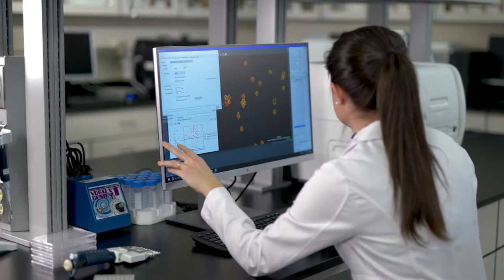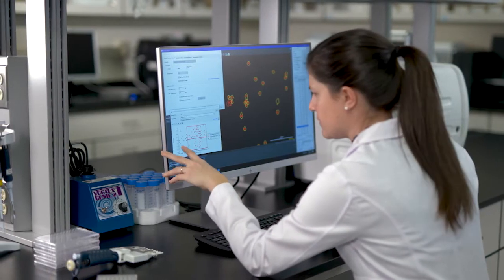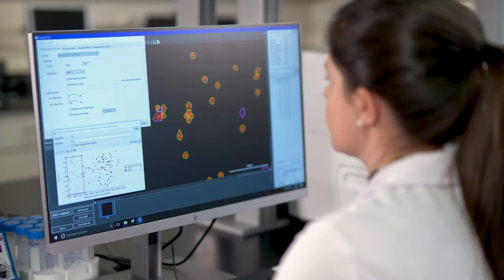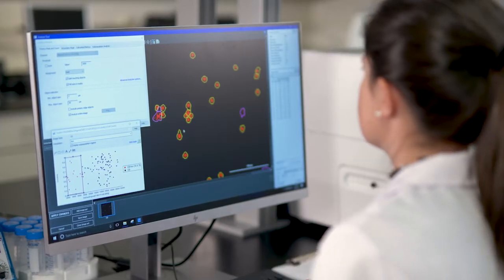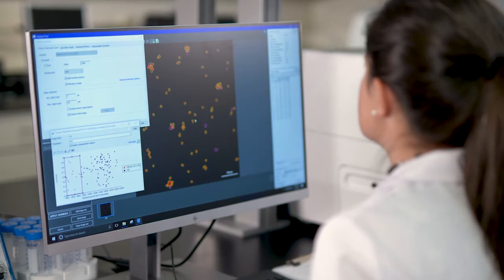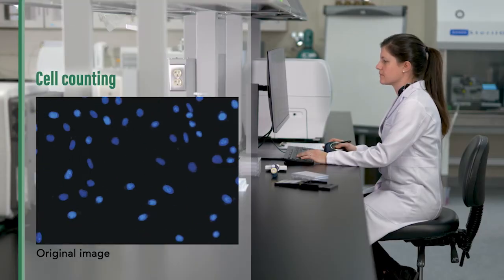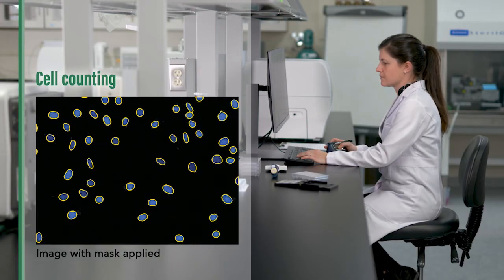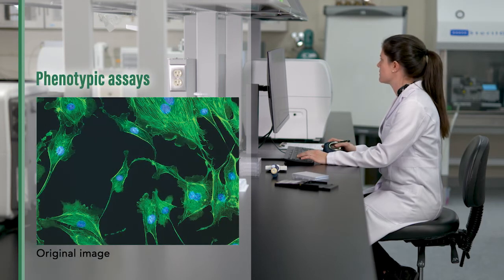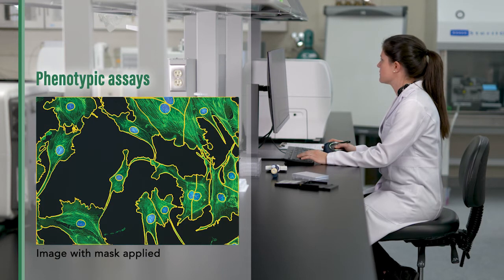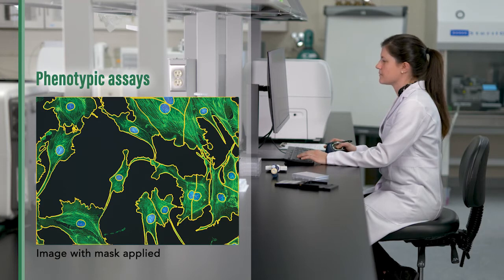Image analysis tools in Gen5 cover a broad range of applications and are powerful and easy to use. Gen5 automatically identifies cell nuclei for rapid cell counting. Cytoplasm size, shape, intensity, and other morphological and phenotypical changes are also easily observed and characterized.